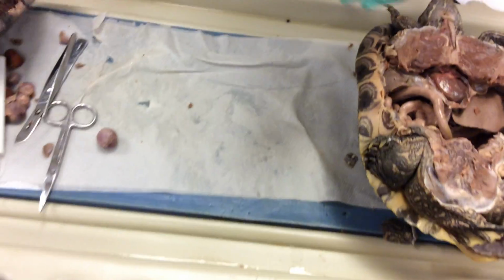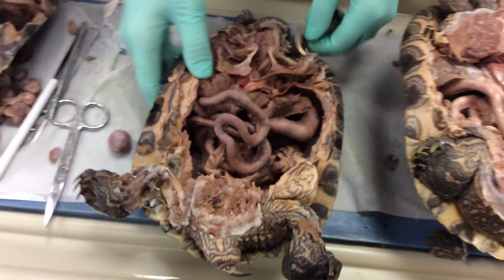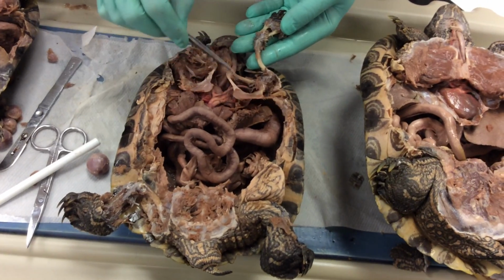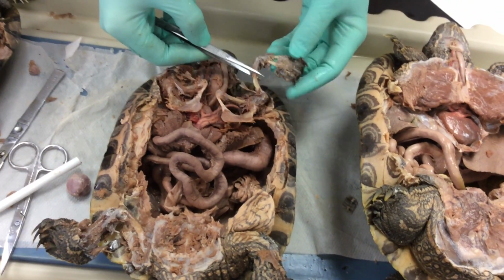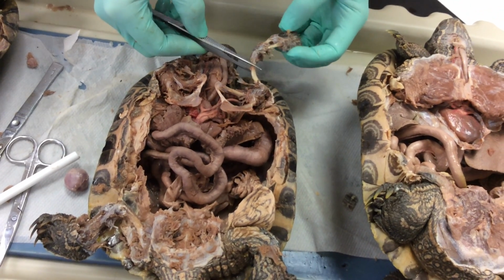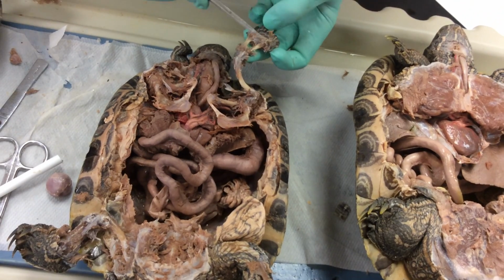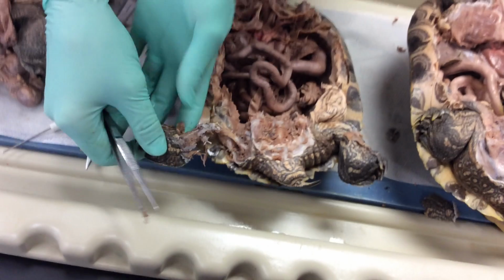Okay, so one more thing we're going to look at here. We're going to look at some bone structures. So this is the pectoral girdle right here, and we've uncovered all the structures in the bone with the scapula. This is the humerus, all right? And then you have the radius and the ulna. And so you've got the ulna and the radius here. And then if we're looking down here, we've uncovered this bone.